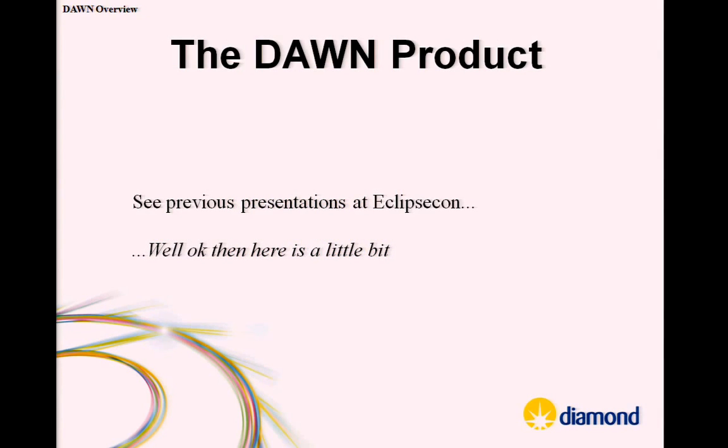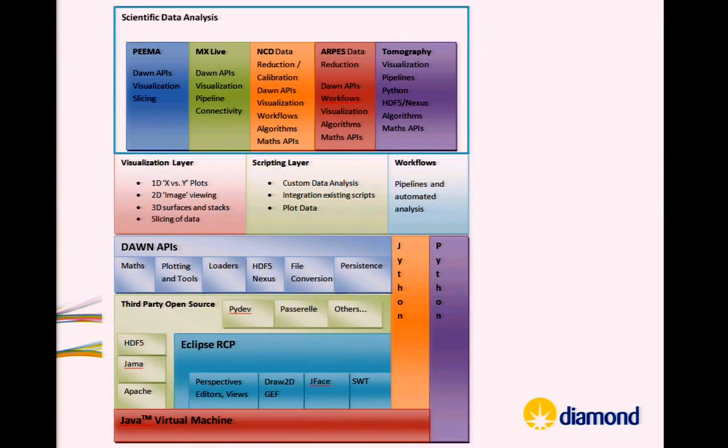So the product itself, I have shown it for half an hour at previous conferences. But I would like to just show you a little bit about that, because there's a few people who probably haven't. Is there anybody who hasn't seen it before? There are a few people at the back, I think. Yeah, so let me give you a brief overview of that.